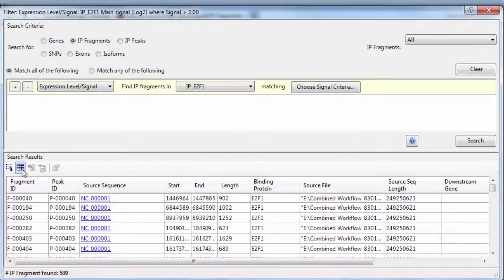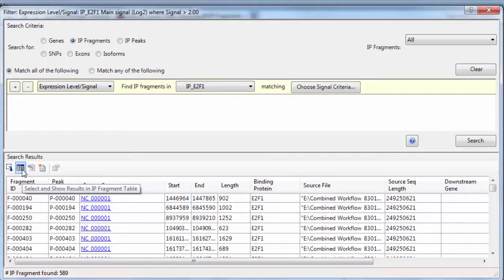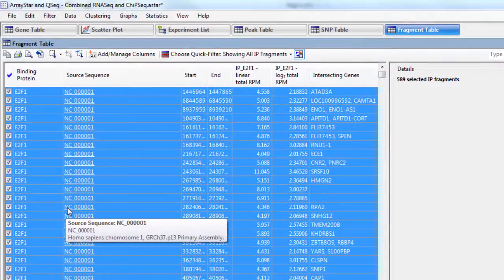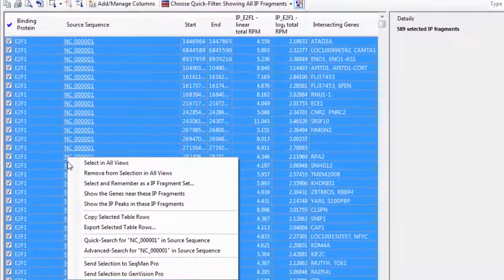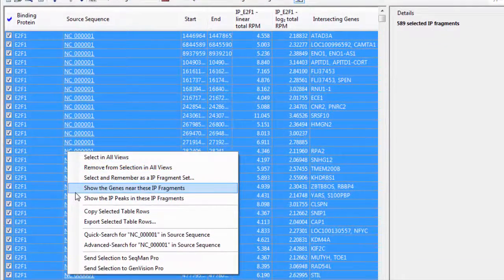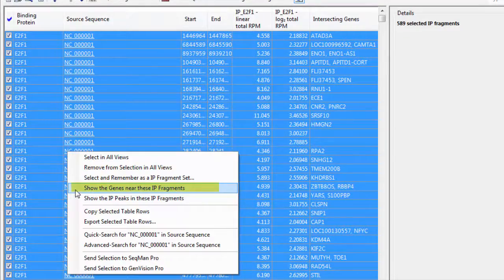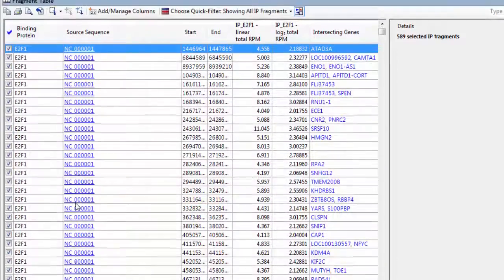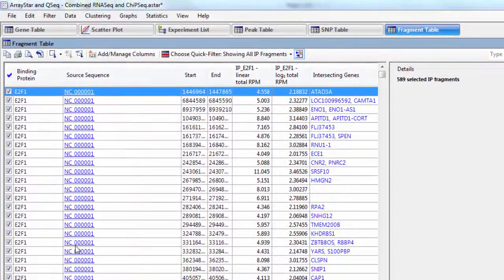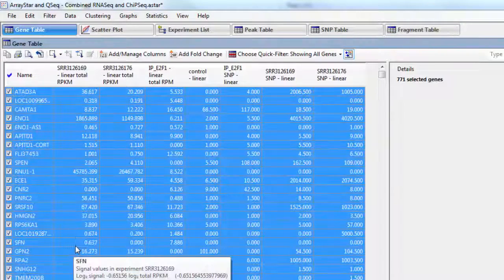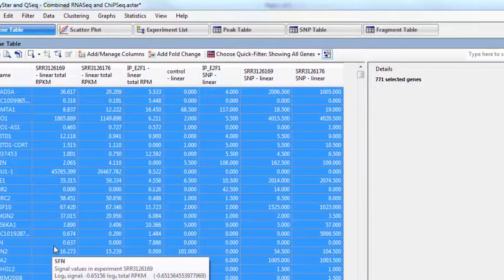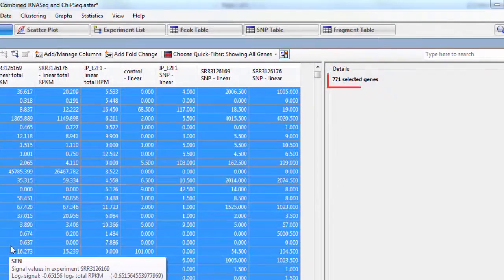I'm going to click this button, which will select the results and show them to me in the fragment table. From here, I'm going to right-click and choose Show the genes near these IP fragments so that I can create a subset of genes near the peaks. That took me to the gene table with 771 genes selected.